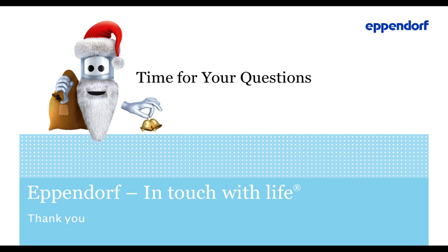Thank you, Ines. I think that answers the question fully. Here comes another bioprocess-related question, and the question is, how long does the sensor calibration take for setting up a bioreactor? Does this have to be repeated for every batch setup, David?